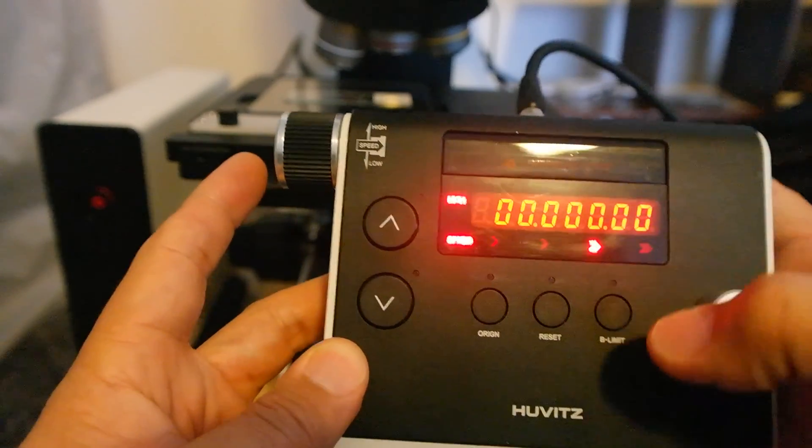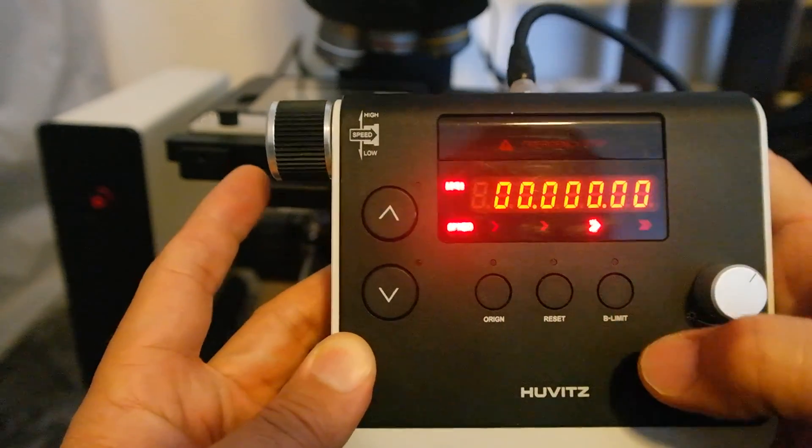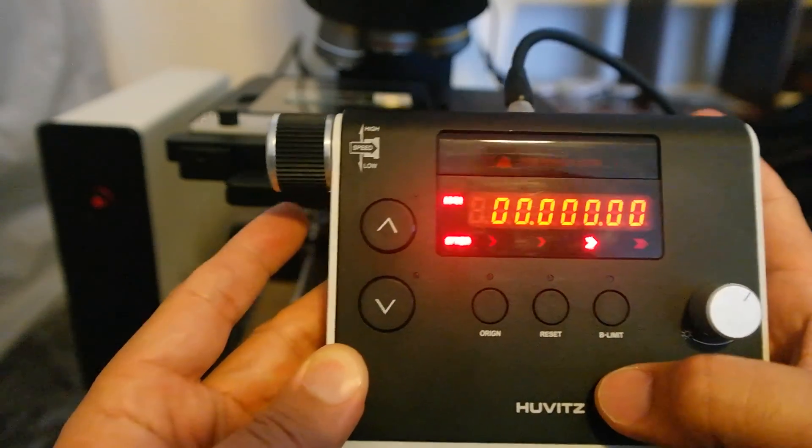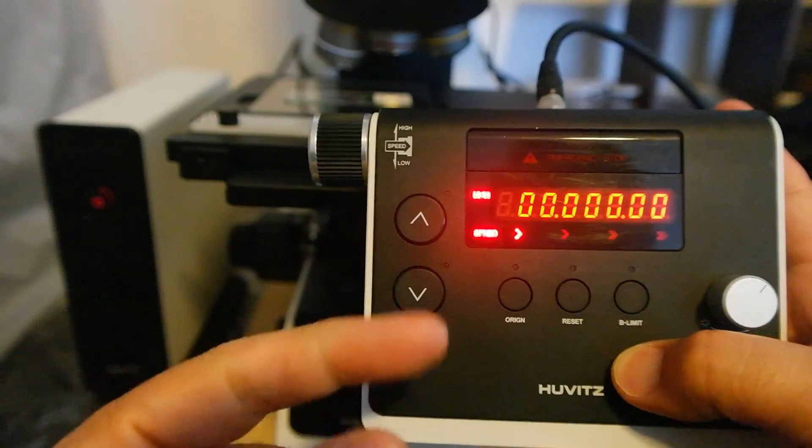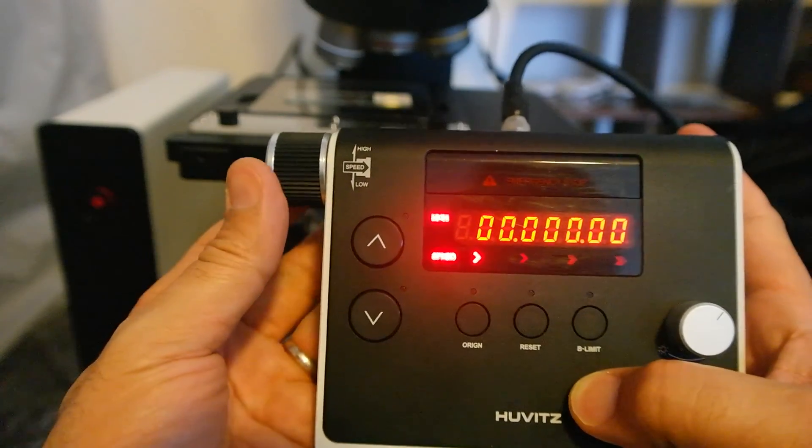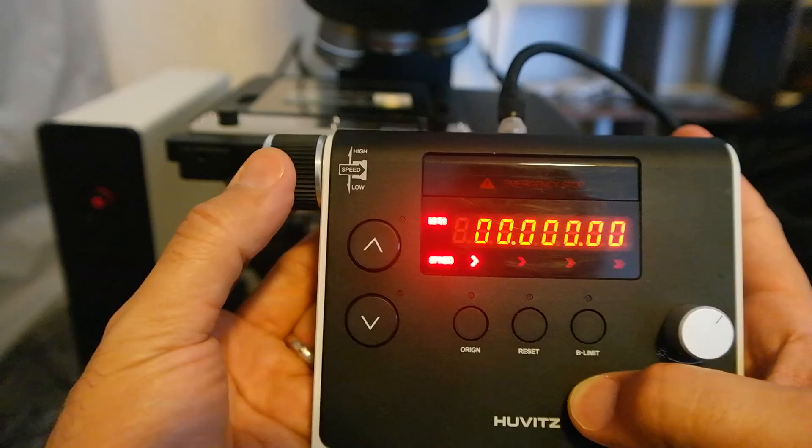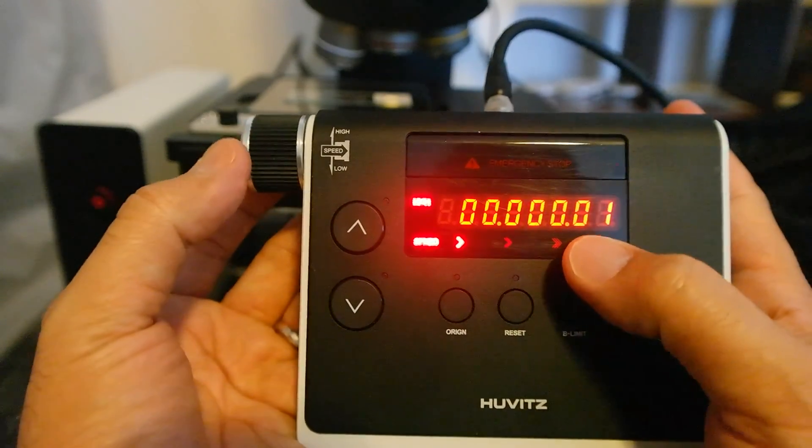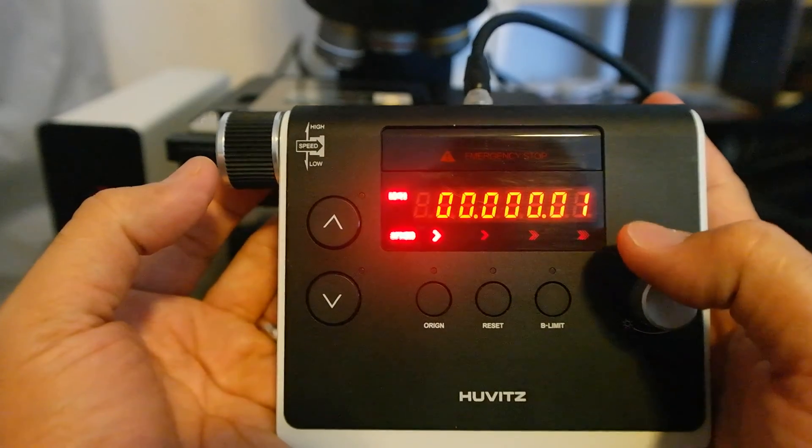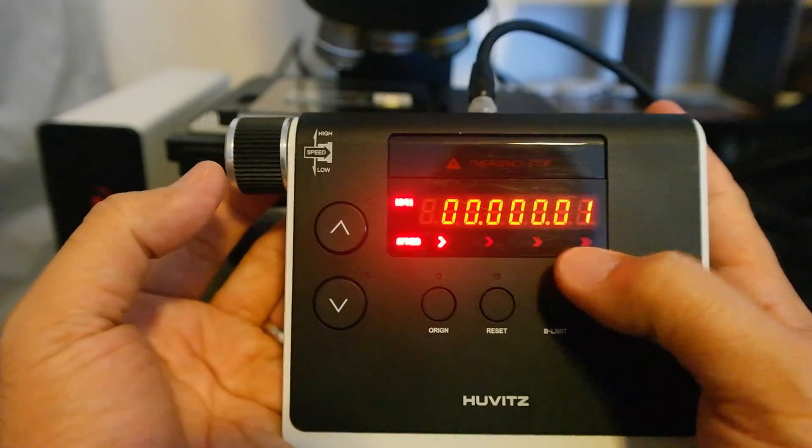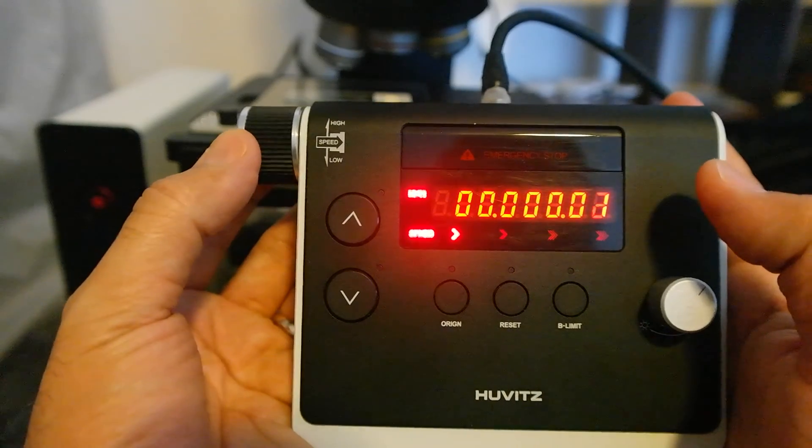For the speed here, since we are in different mode, let me show you what happens. Basically if I go to the lowest speed right now and I use this knob to move this, as you see it is 0.01, which is just 0.01 micron or 10 nanometer, and I can go to that 20.